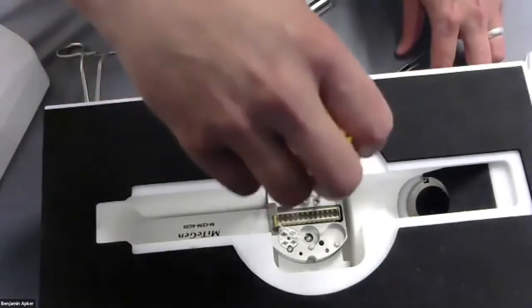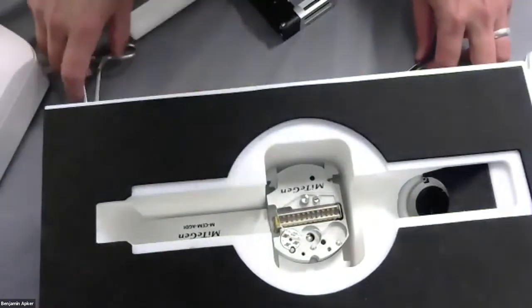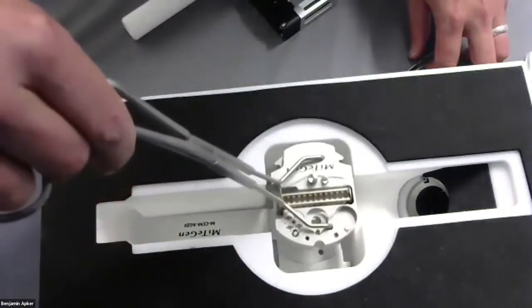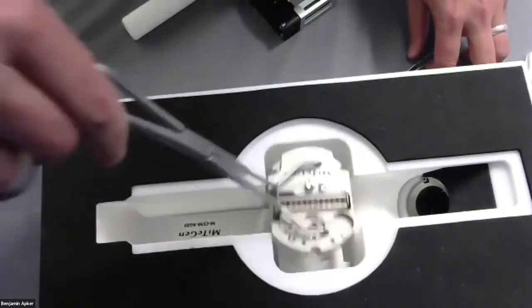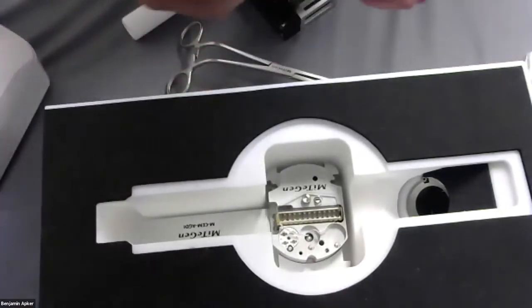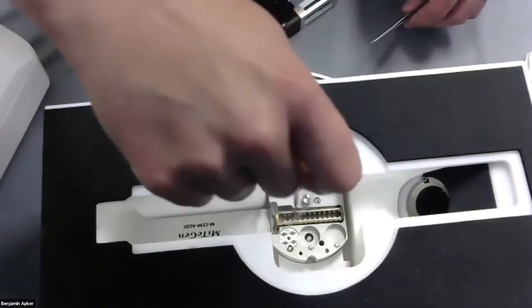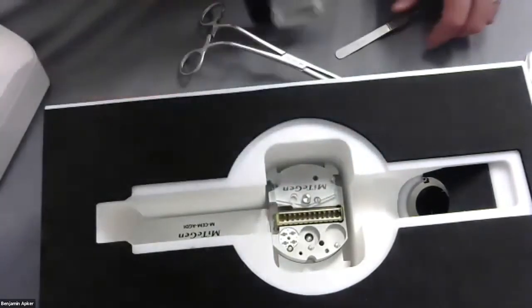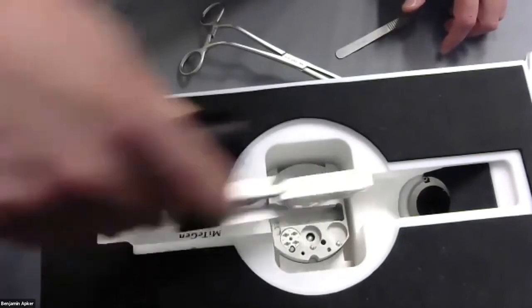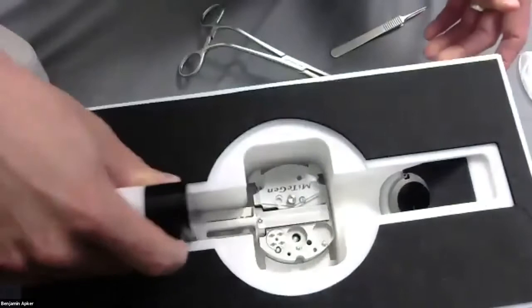It locks in place just like the puck and can then be transferred from here into a shipping or storage dewar. You can also receive an autogrid cassette puck and, using the standard mechanics, open it back up, securely take the transfer tool, and then transfer it into the capsule for loading the automounter or autoloader.